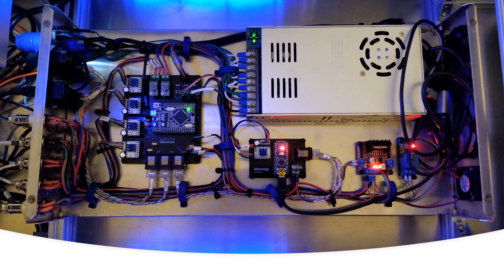Spencer's brain is composed of two Arduino boards. The main board in charge of core XYZ motion is an Arduino Mega and the board that controls the syringe pump is an Arduino Nano. The design is relatively based on open source 3D printer electronic systems and utilizes many of the same components used for a 3D printer.